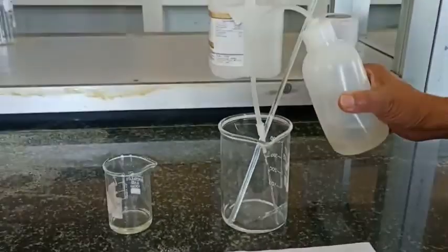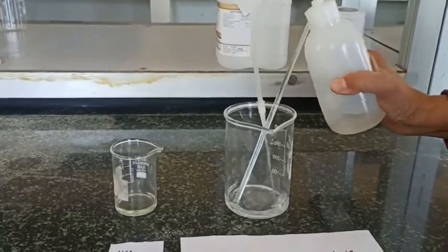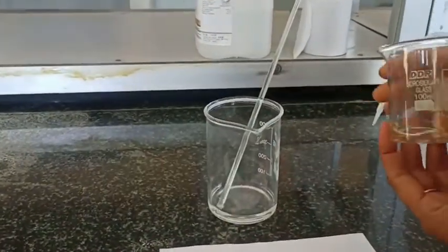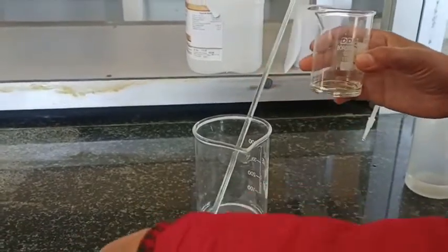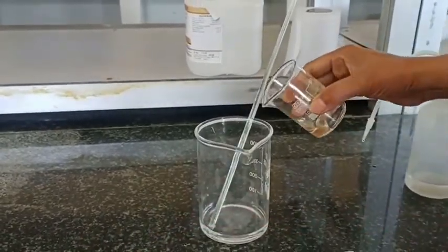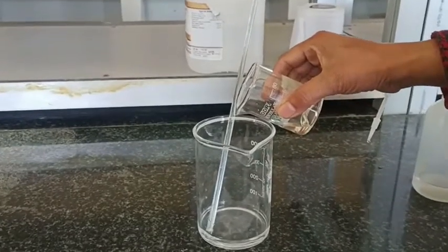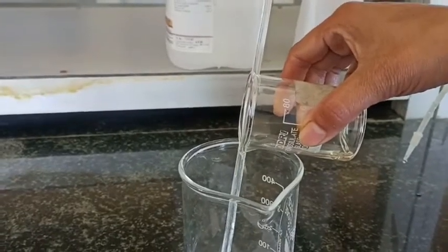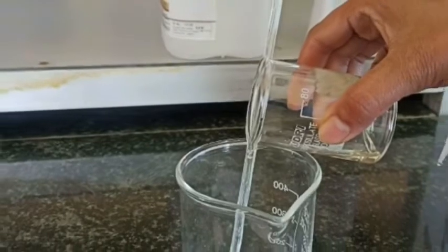Here I'll first take the distilled water in this beaker. You can see the glassware here — this strong HCl is purposefully kept there. We are going to dilute the strong HCl, and with the help of this rod we are adding the strong acid to the water, rather than adding water to the acid.